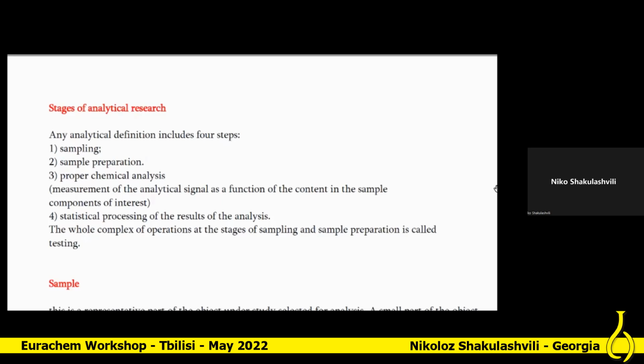Today, we are going to focus on sampling process. It may happen that many of the issues that I'm going to talk about are crystal clear for everyone. You may know about all these issues. And unfortunately, still it happens that there are still many errors connected to the sampling. That is why I'm going to focus on this phase.